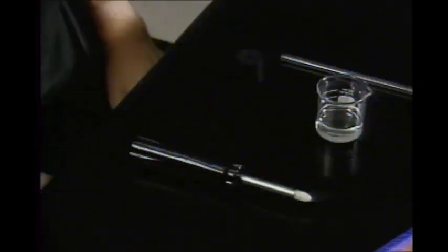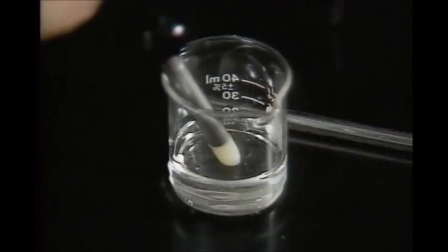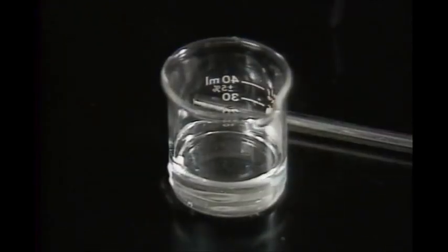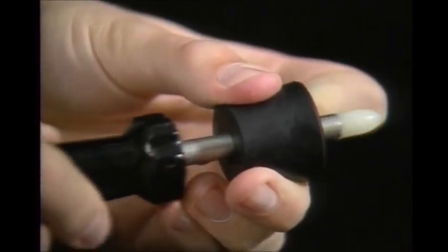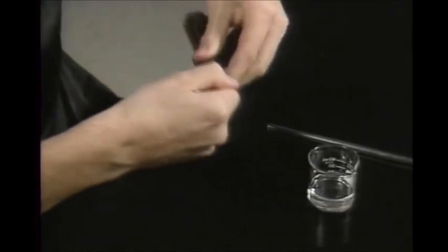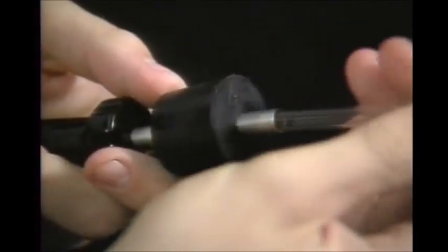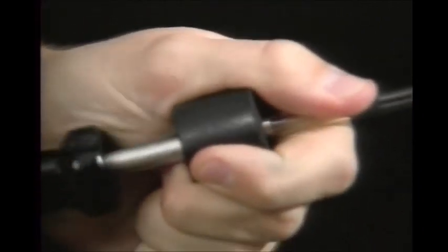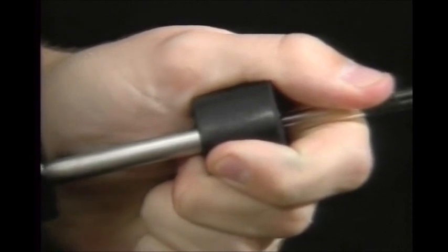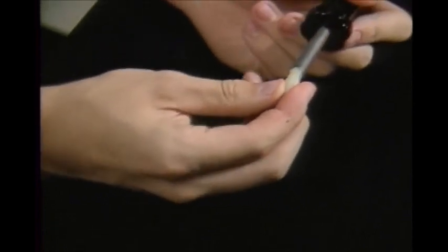One way to avoid this kind of accident is to use an inserter. First, dip the Teflon tip in a glass lubricant such as glycerin, then push it through the stopper. Remove the tip and slide the tubing through the hollow inserter shaft. Make sure to wash the lubricant off the tubing and stopper before using them, and replace the Teflon tip so it doesn't get lost.